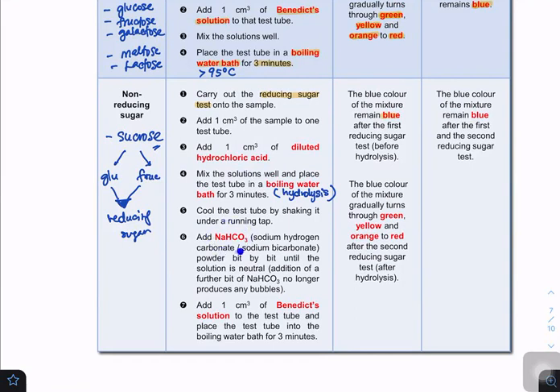Because the reaction between the sodium bicarbonate and the acid releases CO2, we will be able to see bubbles. So when you add it and you can see the bubbles, it means I haven't finished the neutralization yet. If you scoop out a whole spatula of sodium bicarbonate and add it all in at once, you will have a problem. So we add it bit by bit until you don't see any more bubbles.